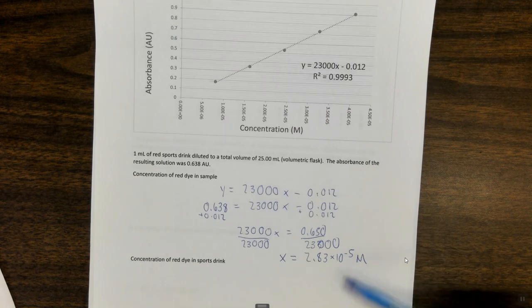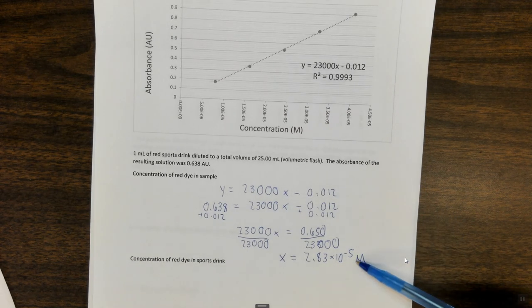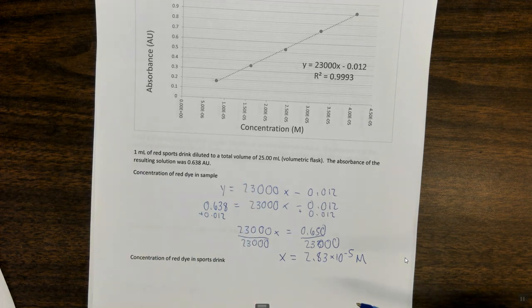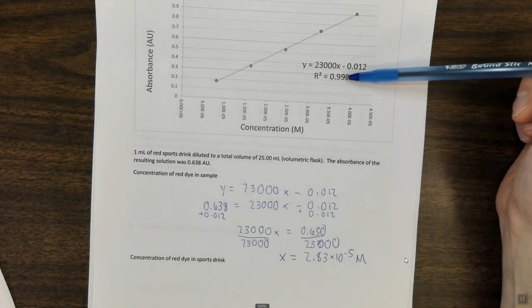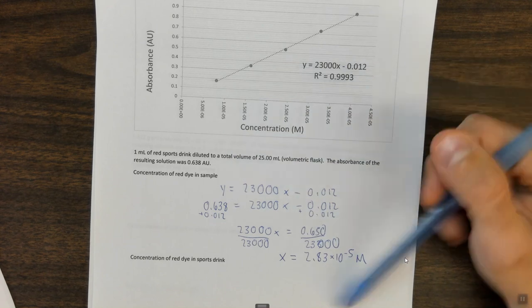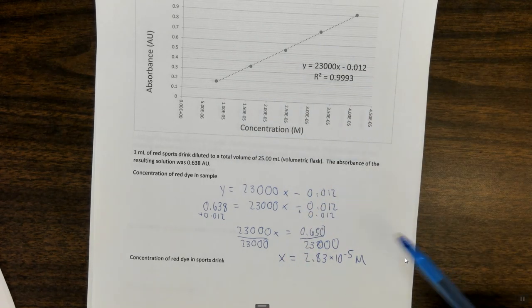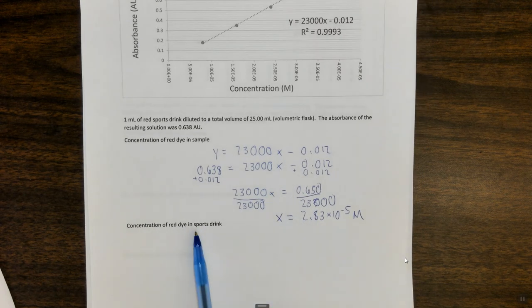So this is the concentration of red food dye in the sample, the 1 to 25 dilution of the sports drink. Okay, notice that I got this using the calibration curve. Also notice that you don't want to have to do this math a bunch of times. Do this in Excel. This can be easily done in Excel once you get the calibration curve, and then you can just drag it over and do it in the other cells, as we've shown you several times.